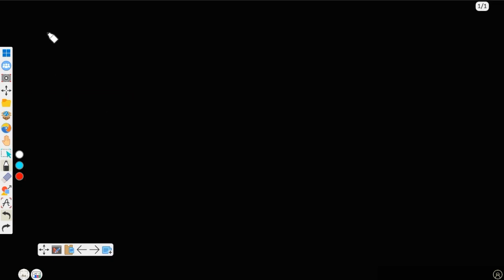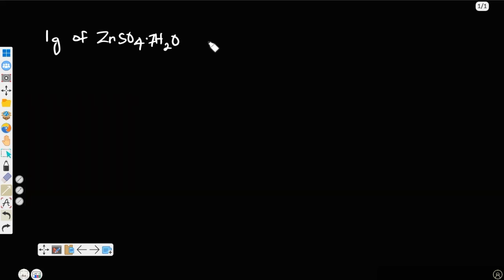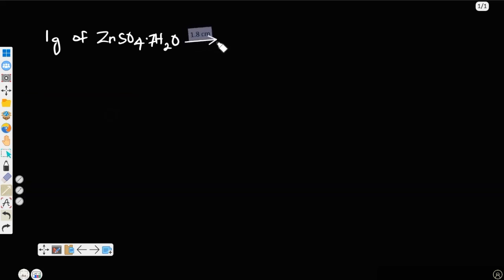So you are going to come here and say 1 gram of zinc sulfate heptahydrate is present in 100 ml mark.